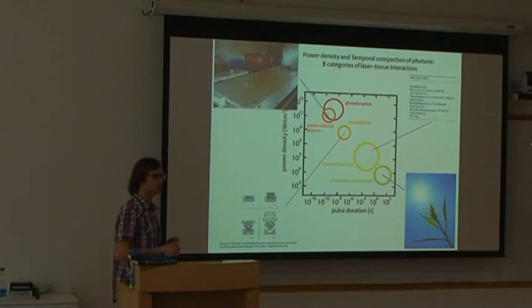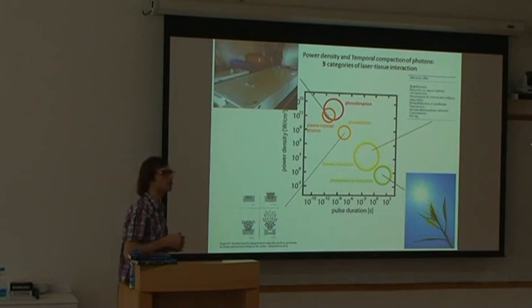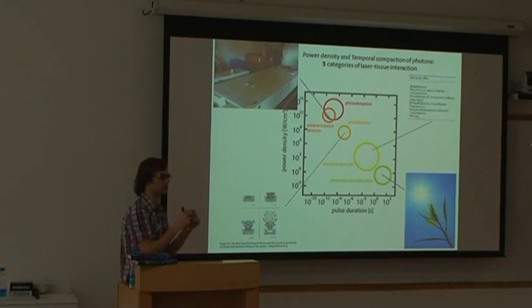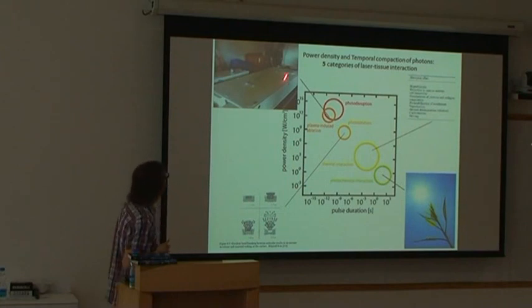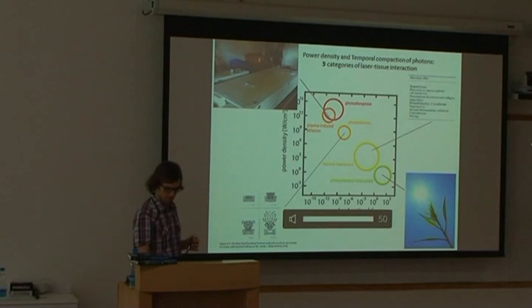Then another technique which is much used now, mainly for biological samples, is called plasma-induced ablation. So the plasma-induced ablation is different because it creates a plasma. A plasma is ionizing the matter. That means that you're detaching all the electrons that will create an electron cloud. In this way, you will locally destroy the matter. So what I took here is just a video from YouTube that will show you a plasma. Because what is interesting about plasma is that the plasma can also emit light. And also, it can make a mechanical wave, so it will emit sound. So the sound, you will hear it from my computer.